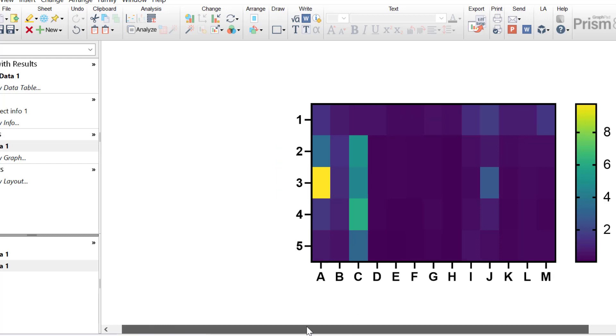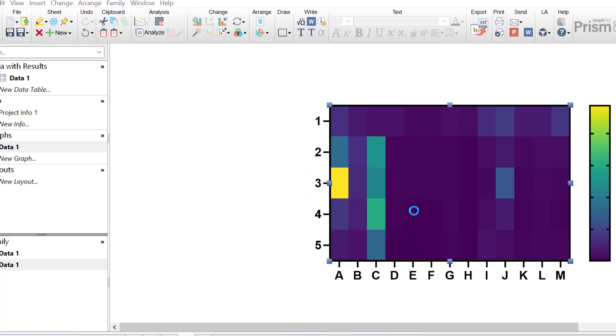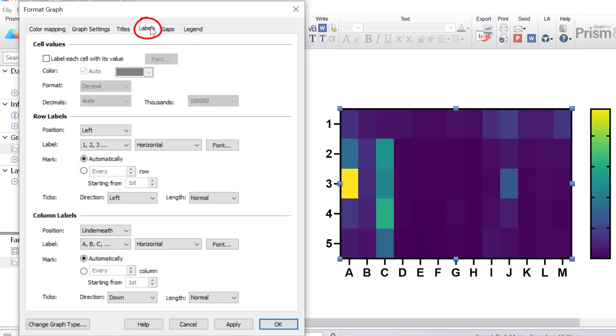At the minute, the row and column labels are just letters and numbers respectively. So I'll change these to be row and column titles so it's easier to read the heat map. To do this, I will double click on the heat map to open up the format graph window.